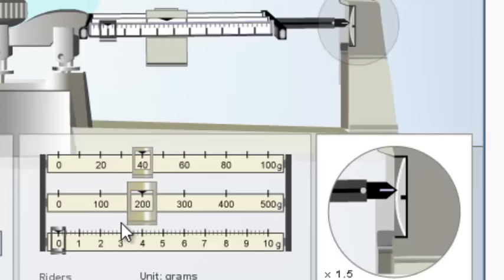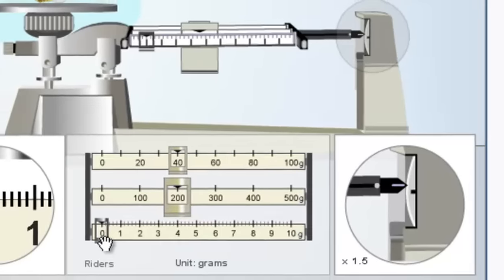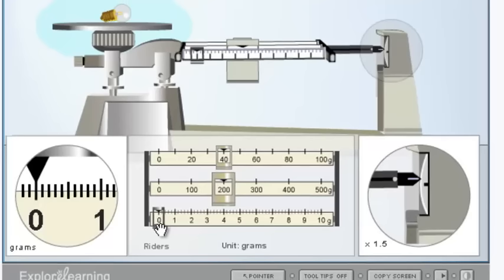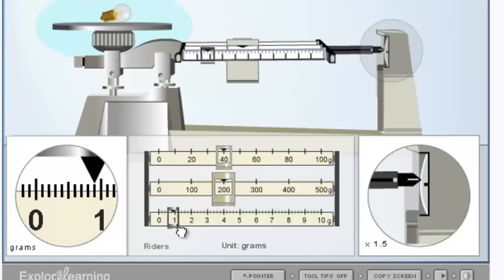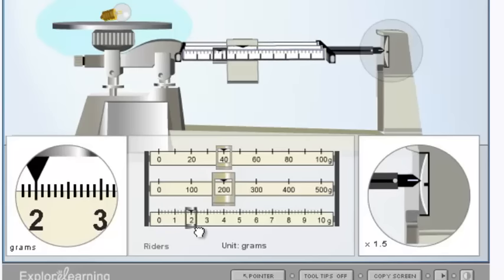Now we have to go to our ones rider. Our ones rider, typically on a balancing class you want to use your pencil tip to move it across because if you use your fingers you might bounce it up and down and have to waste time waiting for it to settle. But if you're careful enough with your pencil tip you can move it across with very little movement and bouncing. So we're just going to move this across right now. Let's drag the ones rider over until we get a perfect balance. I'm moving it and it's not lined up yet so we can continue to move it.